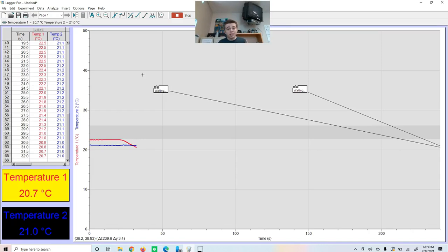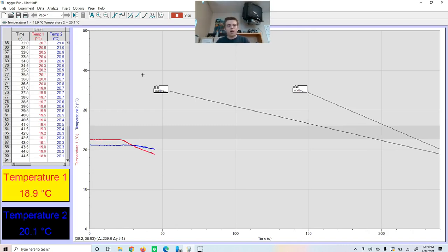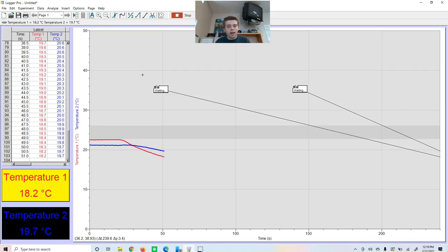So once again, we are going to let this run for 240 seconds. So we still have quite a bit to go. I'm going to let it run probably until it gets to about 50 for you guys. And then I'm going to pause this video so that you don't just have to sit there and watch it run, because it can be kind of boring. Notice how temperature probe 1, which is the methanol, is decreasing faster at the moment than ethanol is, which is kind of interesting to see.